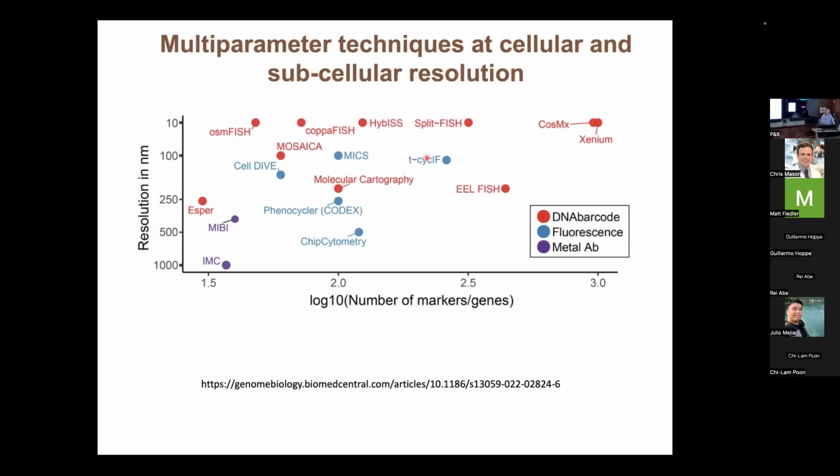I can just mention them here. Again, to pick on the liver, the liver is incredibly autofluorescent. I don't know if you've ever looked at an animal, you throw some UV on it, the liver literally just glows green, and it's intense. So pretty much anything less than 550 is useless to use as a fluorescent probe. And the techniques to eliminate that autofluorescence are somewhat limited. So again, it depends on your tissue.